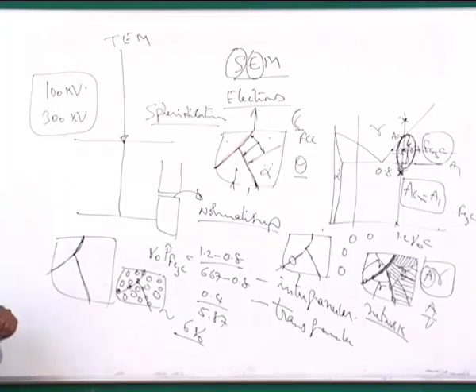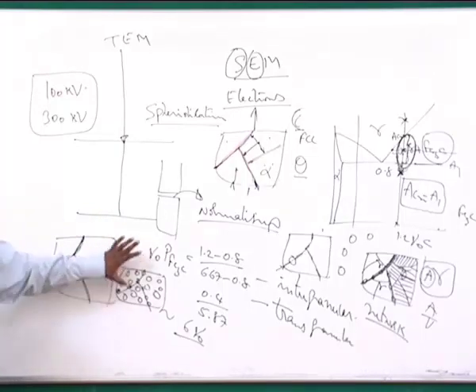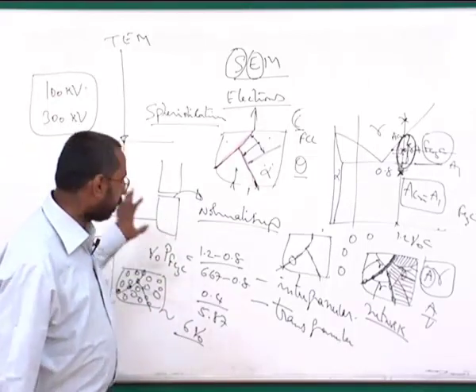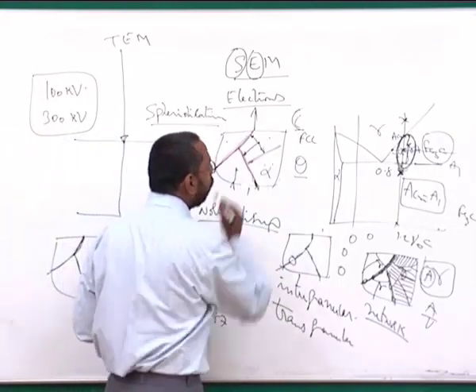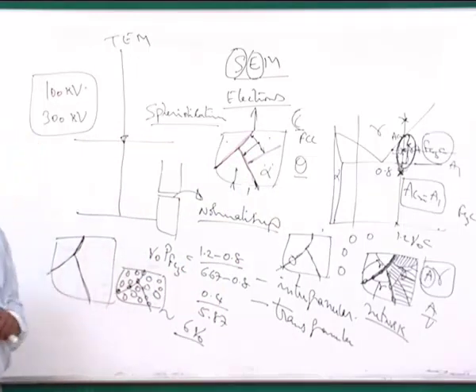Of course, at the same time your ductility significantly goes up, but one has to have an idea of for which kind of application one would like to use this kind of microstructure. So people usually try to have a spheroidization of this grain boundary cementite and control the spheroidization of the complete pearlite.